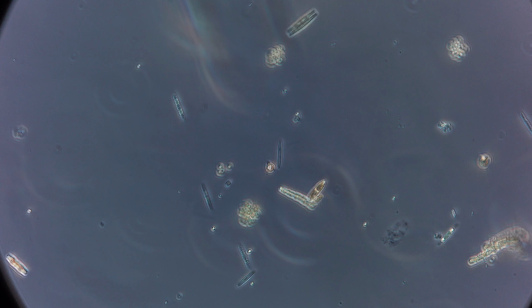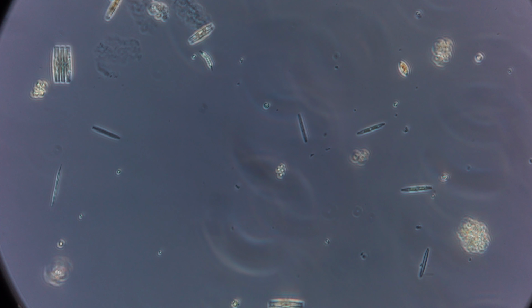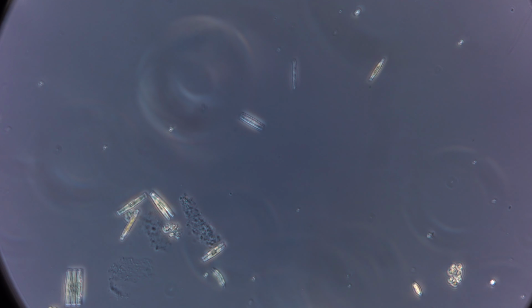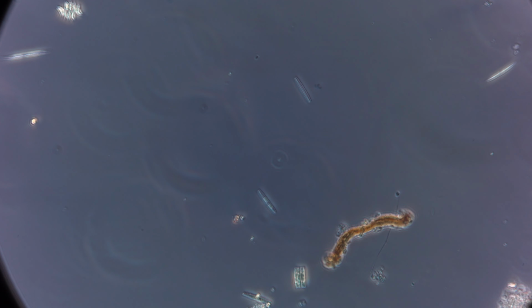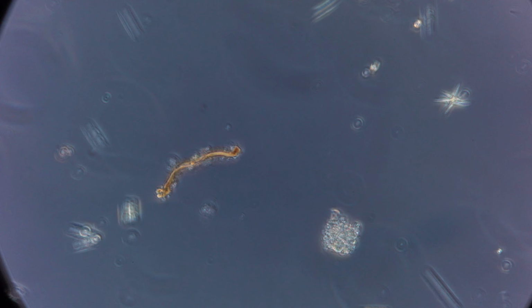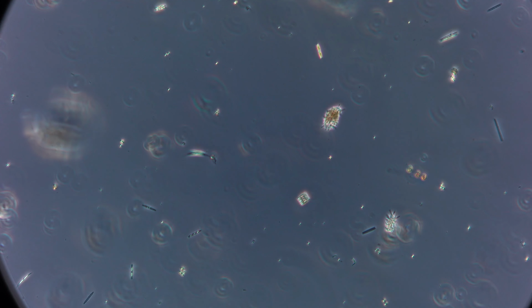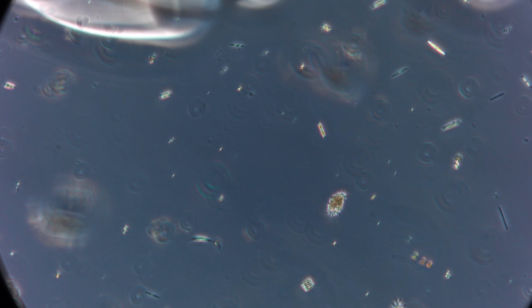Yeah, I watched an amoeba for 2 hours today, so I'm kind of bored of them. Just a quick scan. We can also go to fluorescence. Another amoeba. This is not the best sample for time lapse.